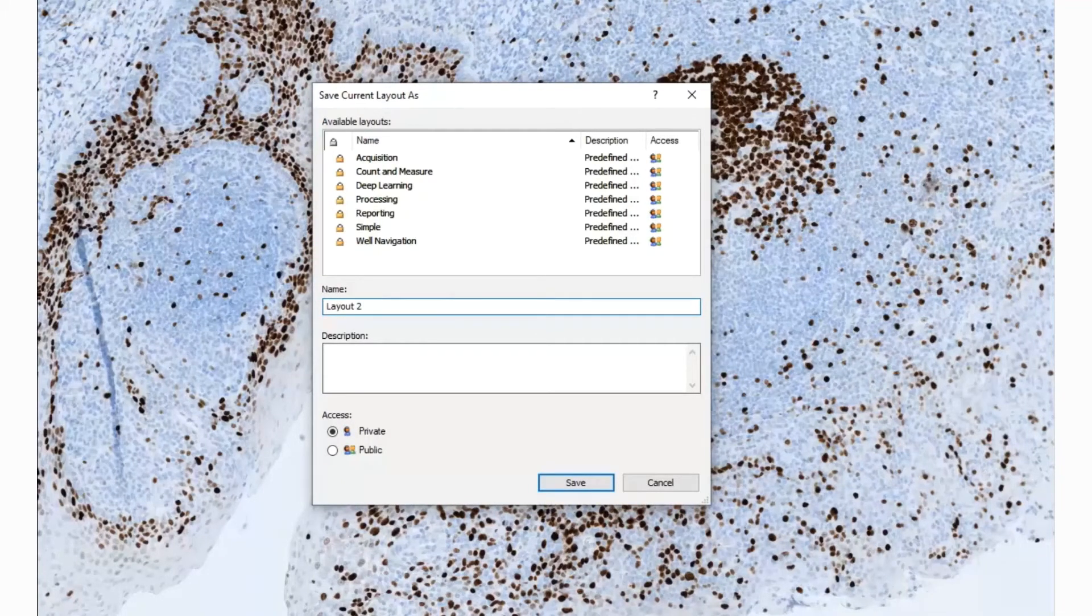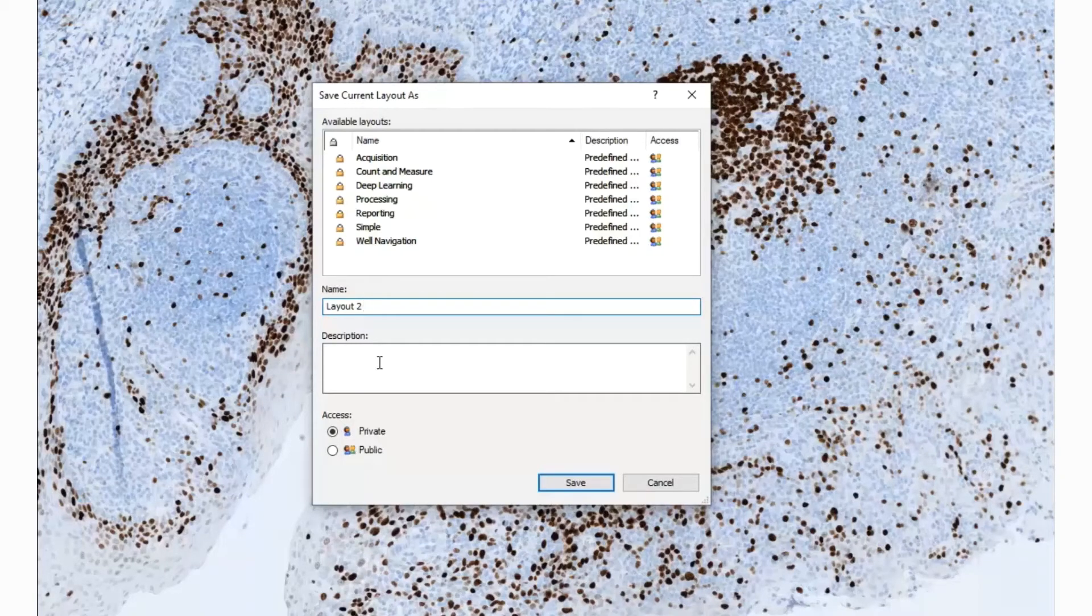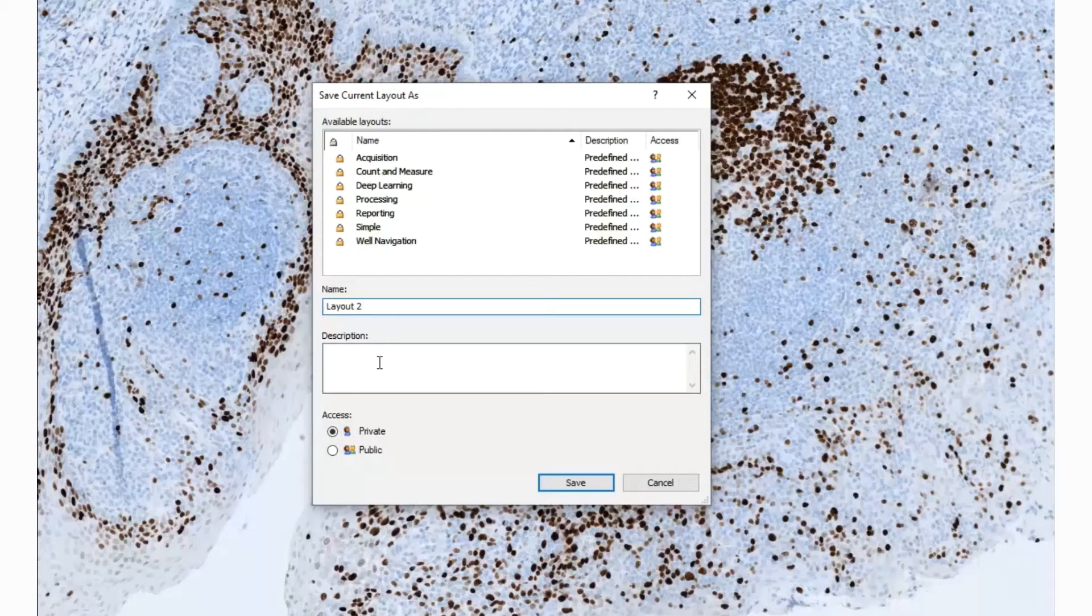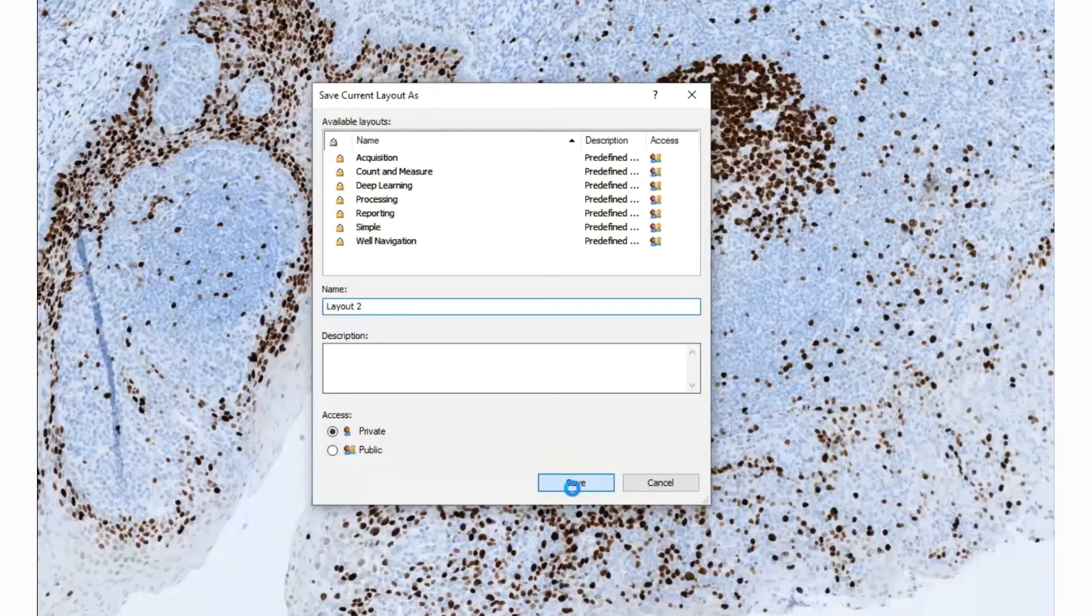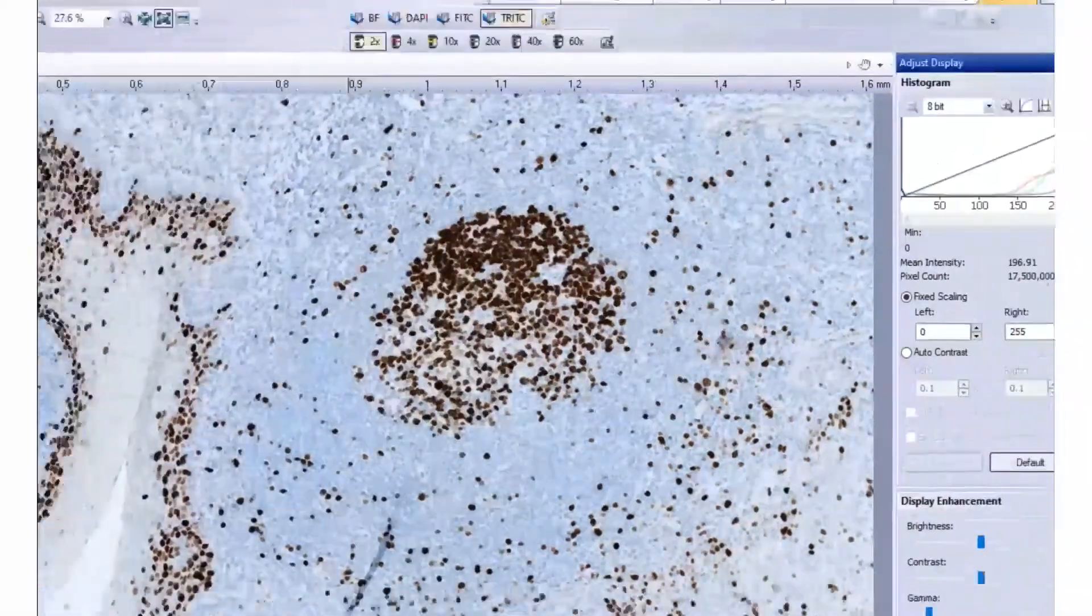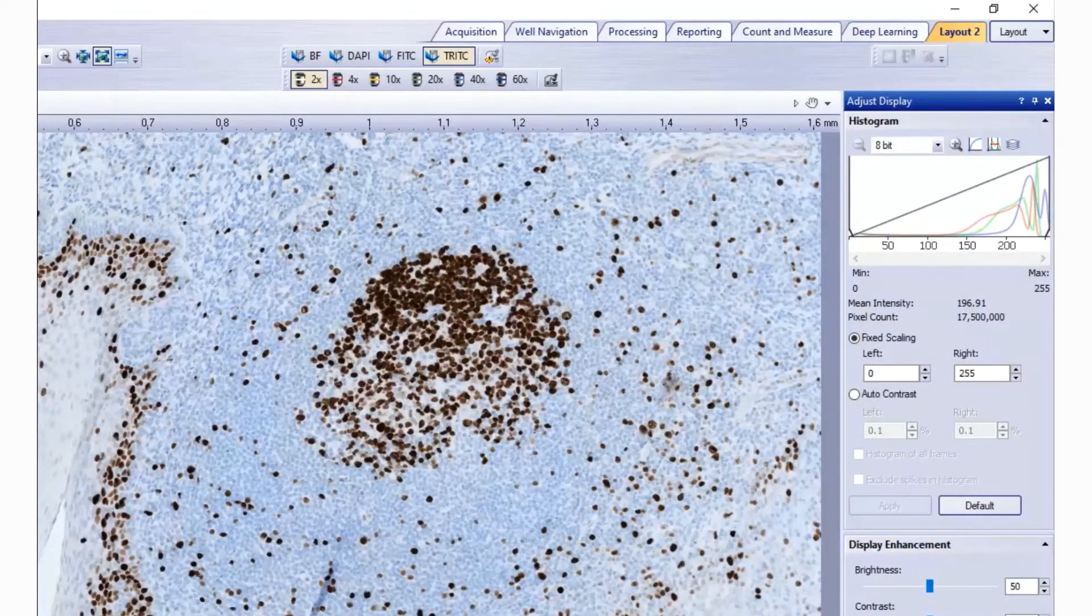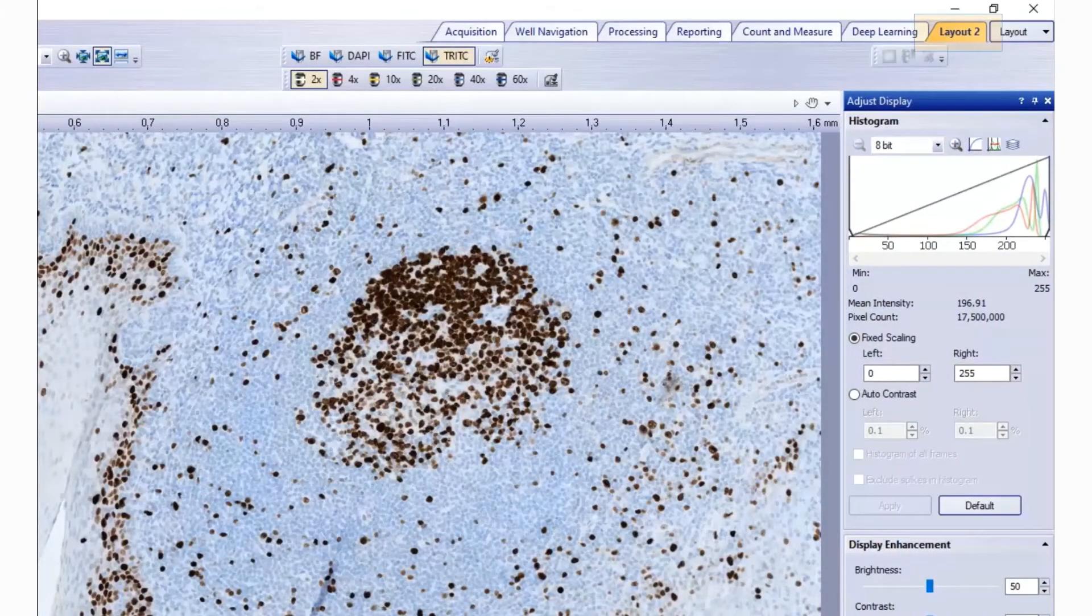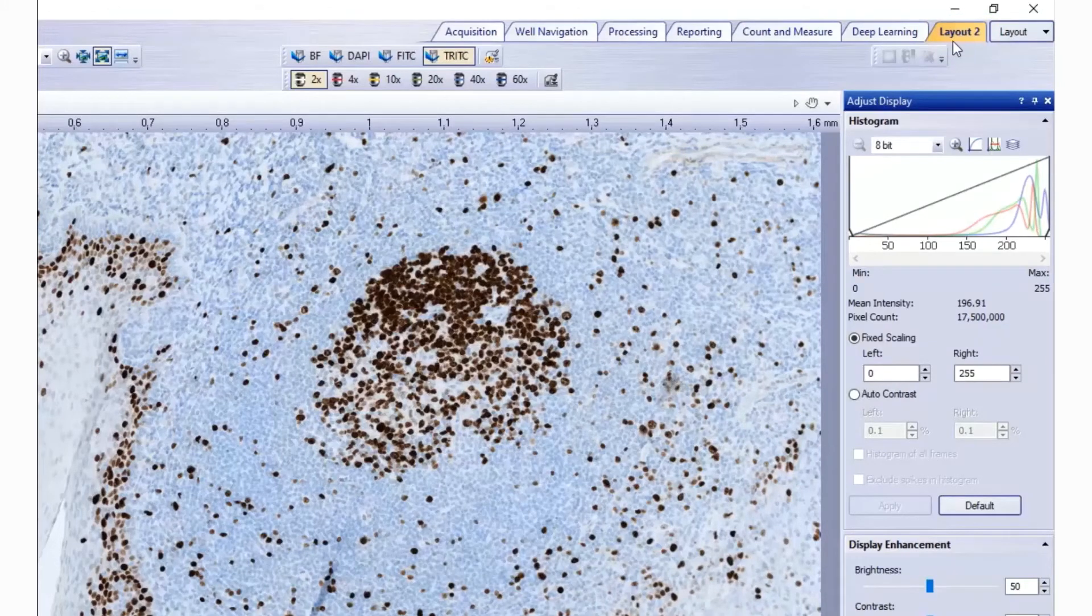And then you can choose public or private if you're the program administrator. If you choose public, it will allow other users to see this layout and use it. Click save and now your new layout will show up as an additional layout tab in the upper right hand area of the interface.